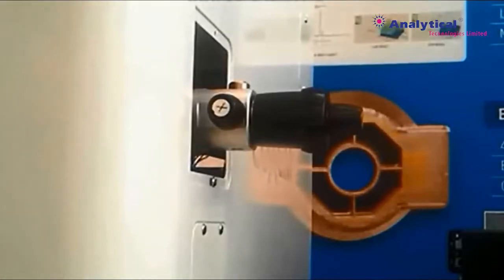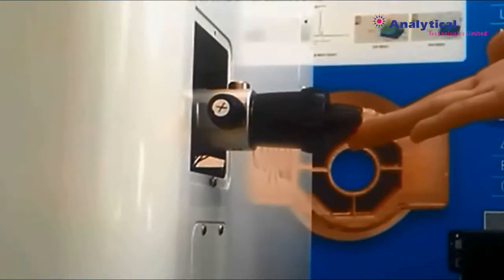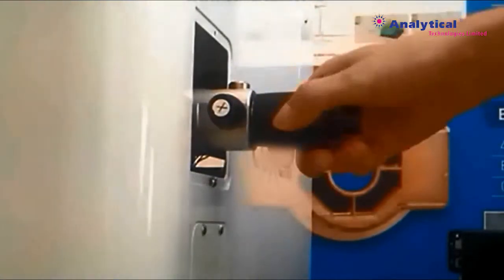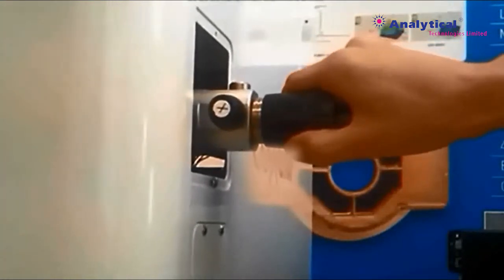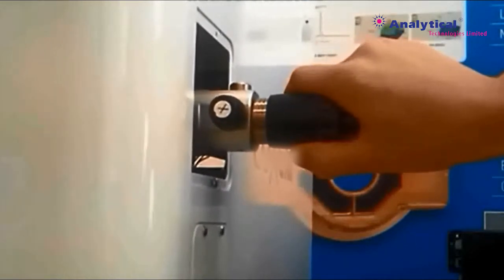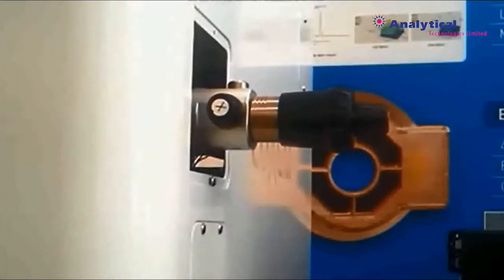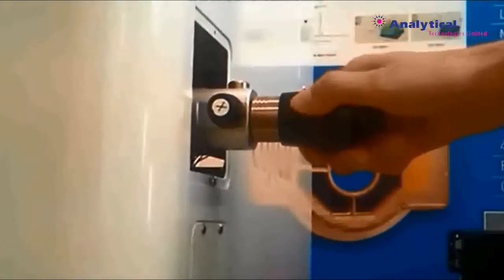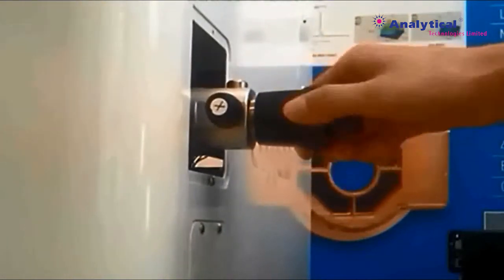In the microscope, there is a diaphragm which can control the beam size. For adjusting position, there are two knobs in the X and Y direction, and diaphragms have various sizes: 30 micro, 50 micro, 100 micro, and 200 micro. You can opt not to use the diaphragm depending on the situation. You can control it 200 micro, 100 micro, 50 micro, 30 micro, in reverse.